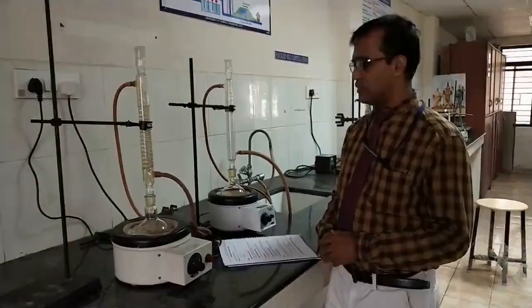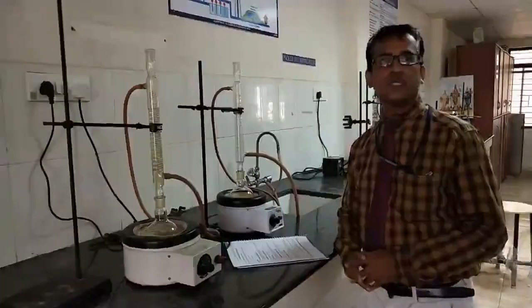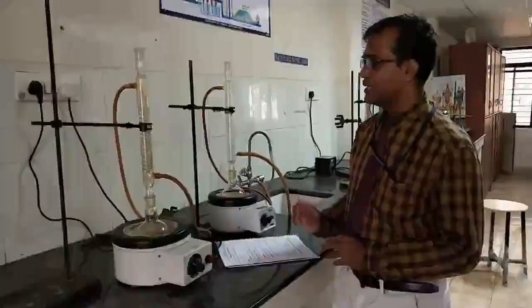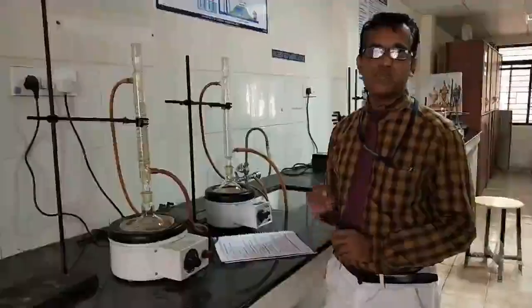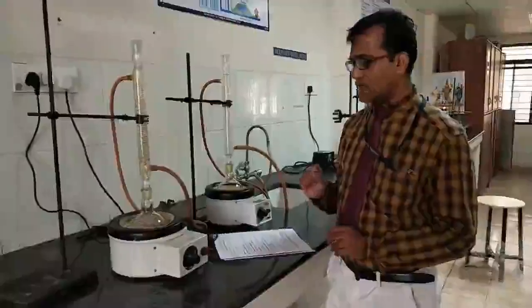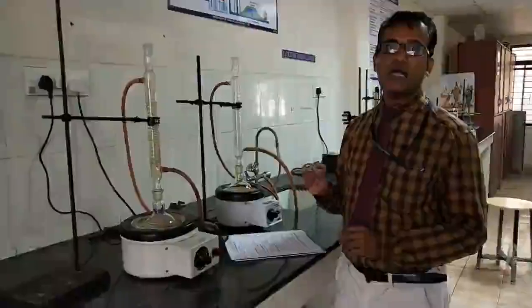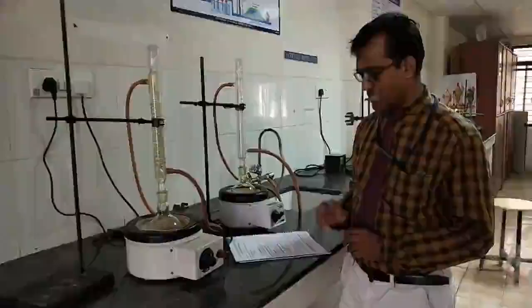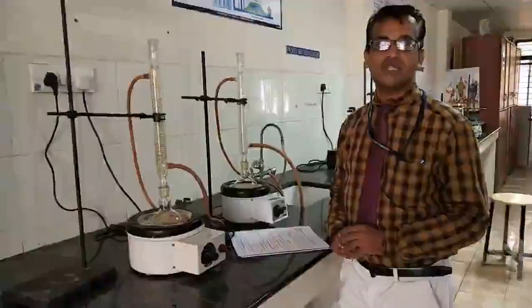Conduct COD, which is nothing but chemical oxygen demand. It is one of the very important parameters to determine the quality of a wastewater sample. It is the oxygen required to break down the organic compounds, which can be found out by using a chemical. That's what we call chemical oxygen demand.